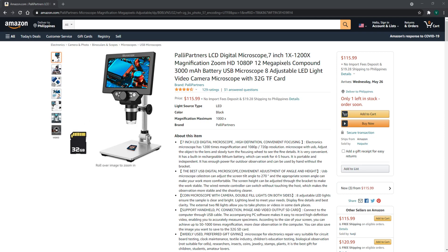You can adjust the screen tilt angle to 270 degrees, and the appropriate screen angle can make your work more comfortable. The screen height can be adjusted through the bracket to make the work more stable. The wired remote controller can switch without touching the host, which makes the observation more stable and the shooting more clear.